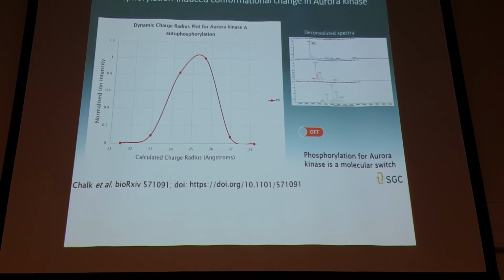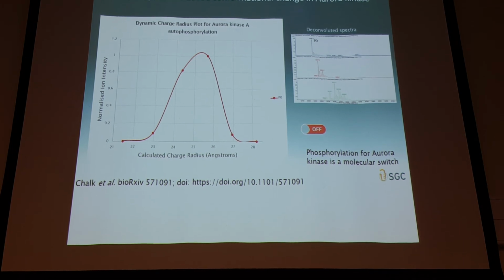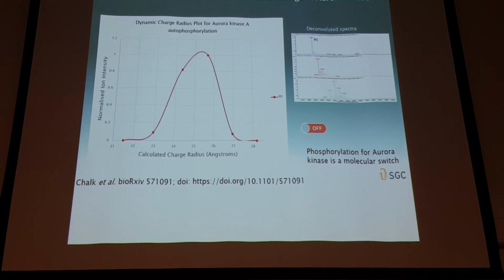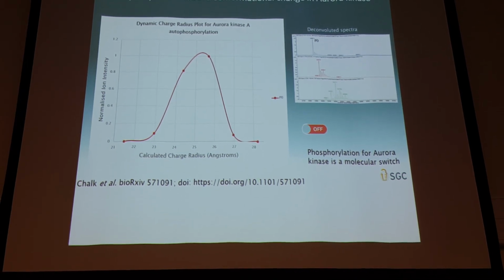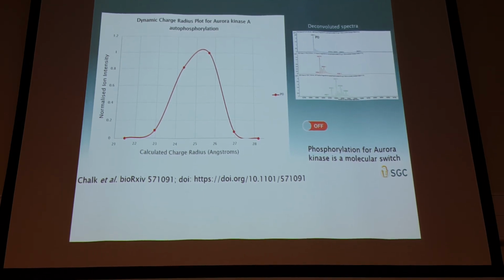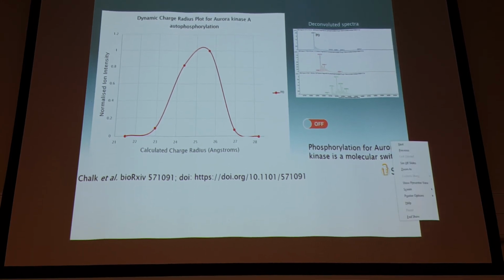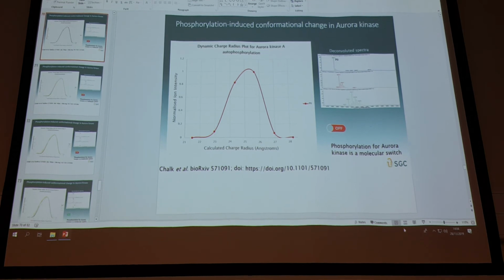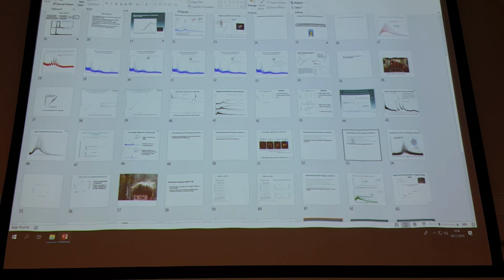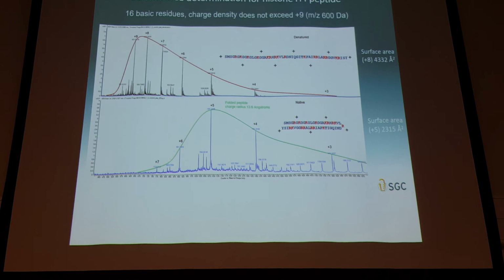And what limitation is there, other than DMSO, in terms of looking at particular proteins with highly charged termini, like histone proteins? I showed a histone earlier. Do you want to see it again? It doesn't matter about the nature of the protein, as long as it's native and has some type of native conformation. I didn't really fully explain this. So this is a histone protein.